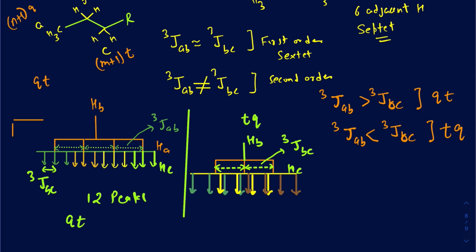So then you're going to have another 4 signals there. So the distance between the first 2, you can use that distance to actually figure out the coupling between the A and B in this case. And obviously, remember the AB coupling constant is actually smaller in this particular case. So like I have said in the previous case, I didn't really overlap those, but then I did mention that they could overlap with one another, and that's what makes it so difficult when you're looking at these tree diagrams.